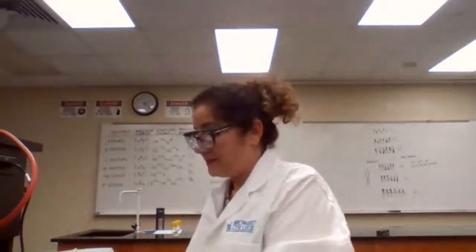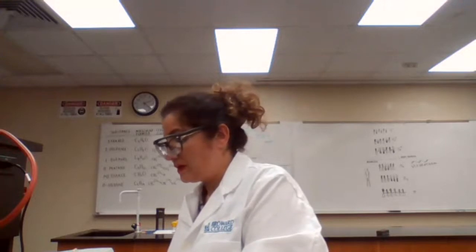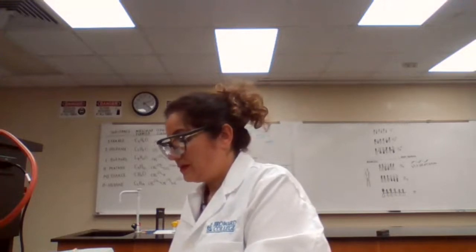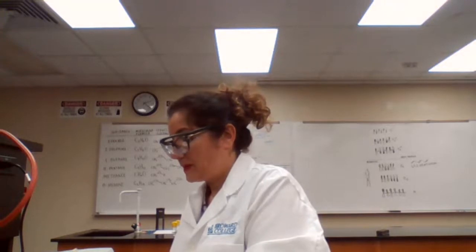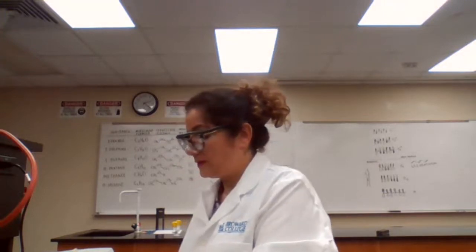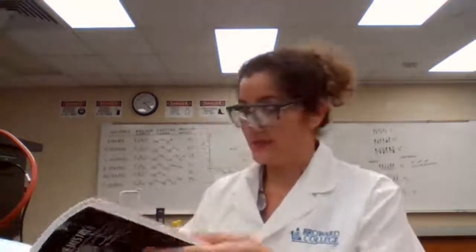Okay, perfect. We are done with the experiment. In order for you to find the concentration, you are going to follow the procedure. Again, if you have any questions, if I was teaching the course, you would ask me. If someone else, another professor teaching the course, you would ask. But at least you have your data.